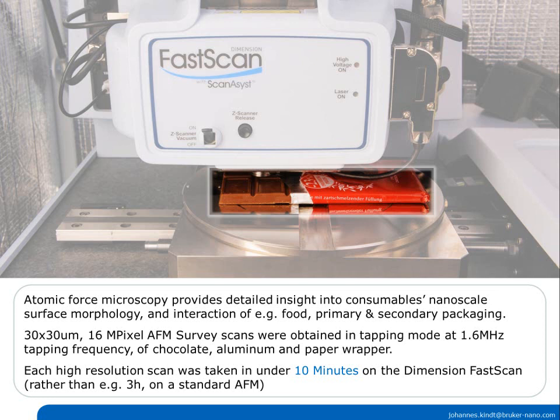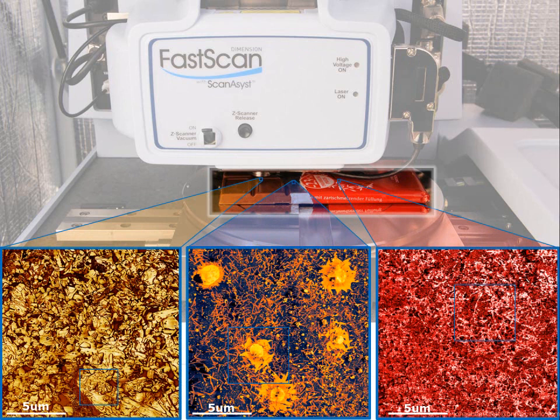Each high-resolution scan was taken in under 10 minutes on the Dimension FastScan, rather than, for example, 3 hours on a standard AFM. Here we see the results. The 3 images are already 2x zoom-ins of the original 30 micron 16 megapixel images. These are phase images of the chocolate surface, the aluminum foil and any material that may cover it, and of the paper wrapper. Each 16 megapixel survey was taken in under 10 minutes.